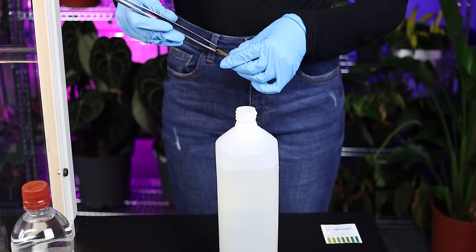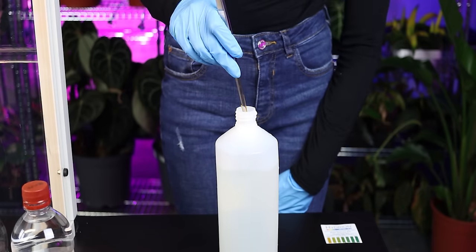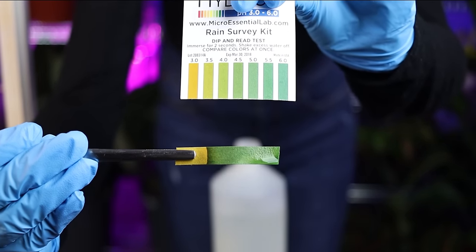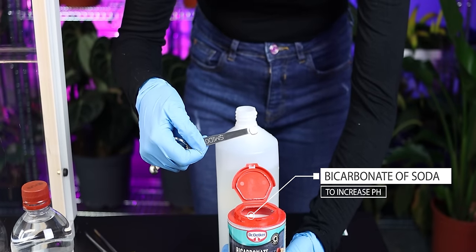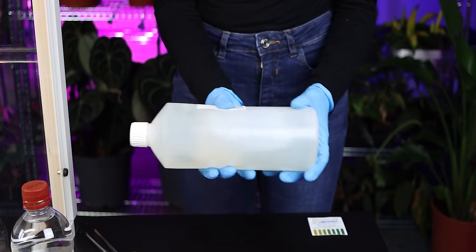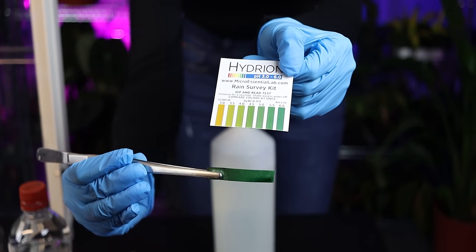I'm then going to check the pH. Now this needs to be between 5.5 and 5.8 in order to ensure we have optimal conditions for nutrient uptake. Should we find that our pH isn't quite where we'd like it to be, we can always add a little bit of vinegar if the solution is too alkaline, or bicarbonate of soda if it's too acidic. This should bring the solution to an acceptable pH that we can work with. I'm checking the pH again, and as you can see, we've raised it just enough for it to be acceptable.